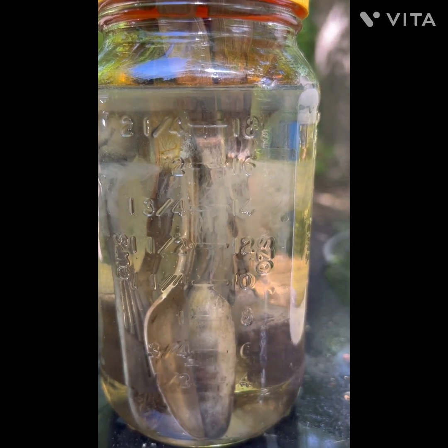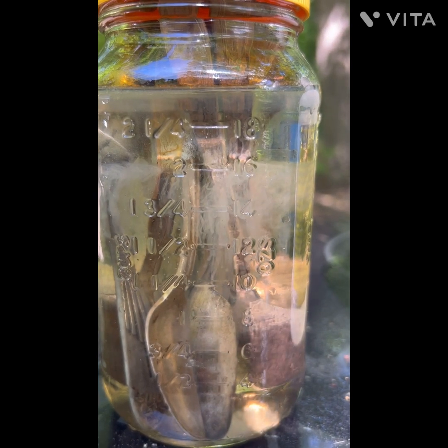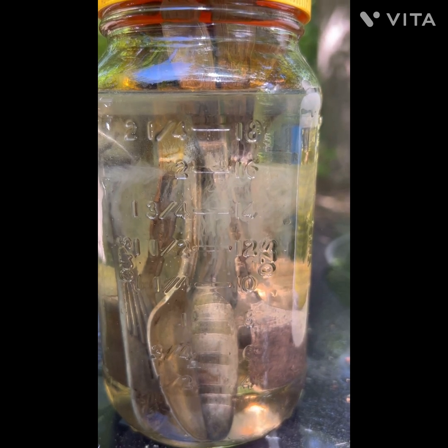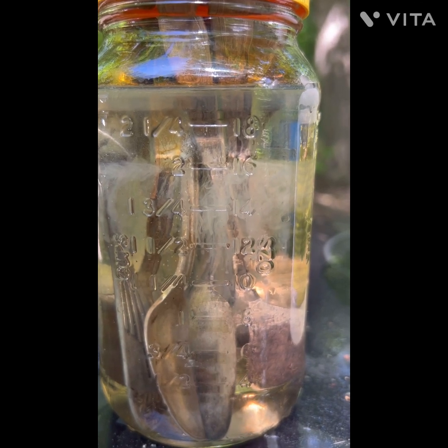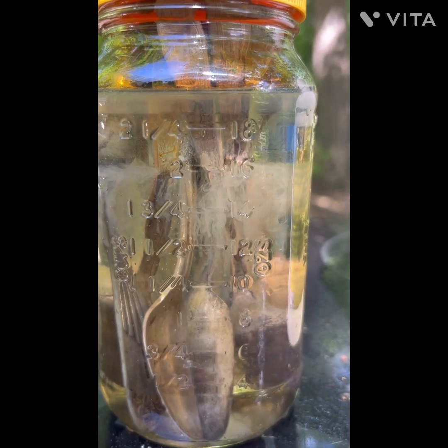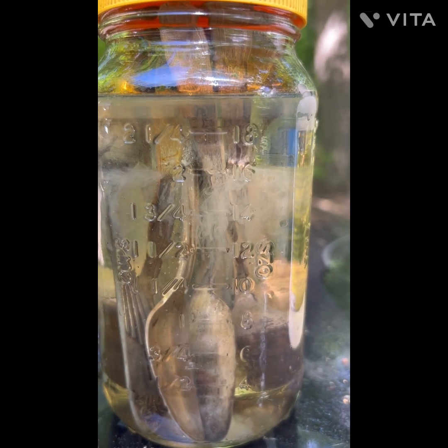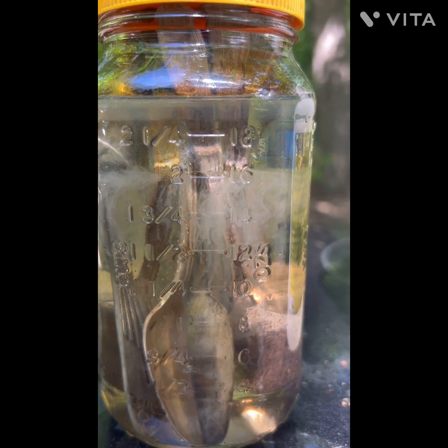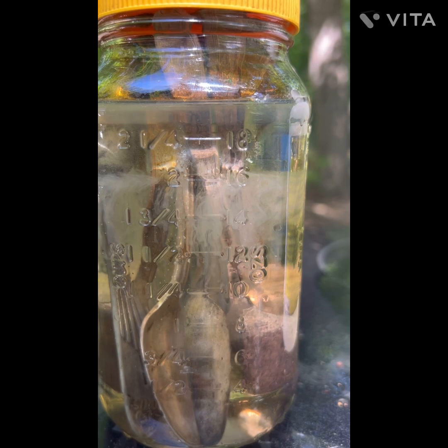That's just sulfuric acid with a little bit of nitric acid, because I couldn't find my potassium nitrate bag. So I had to get cooking with what I had. We'll just use a little bit of nitric acid and see how well that works. We'll let it work and come back.